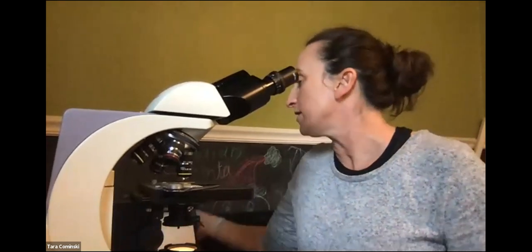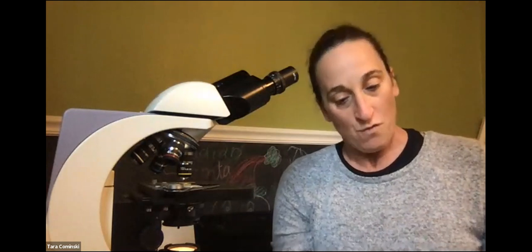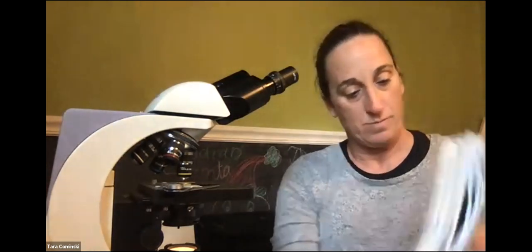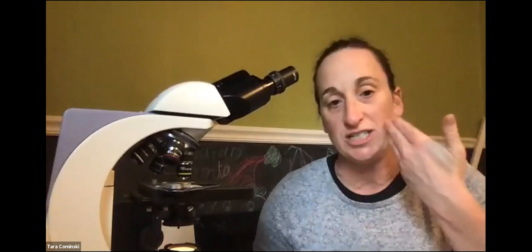Okay, guys. Now, the last part of this lab is to make a couple of wet mounts, and that's the last two things we're going to do. The other thing you're responsible for is completing laboratory review 2, which is on page 27. That needs to be completed. We're going to start off with the wet mount on page 24, and this is for onion cells. It has you do a wet mount for onion cells and also for cheek cells.